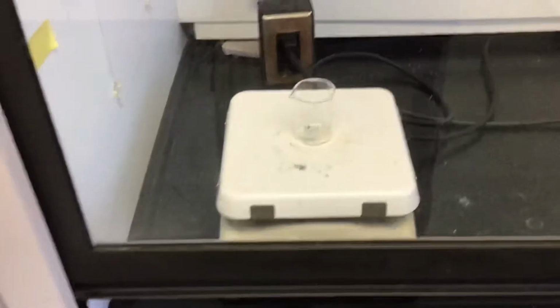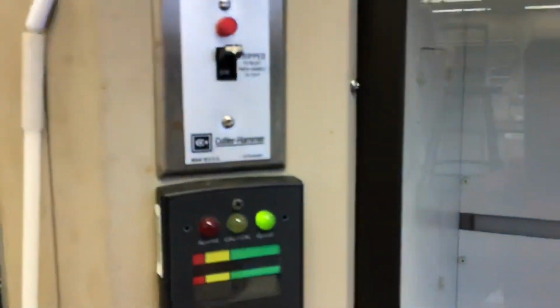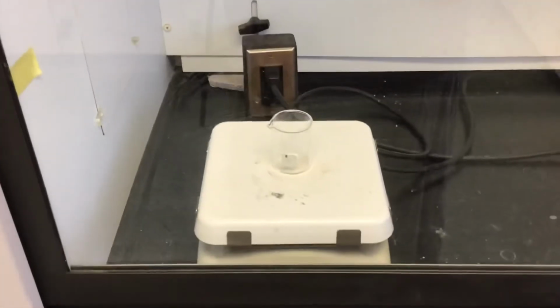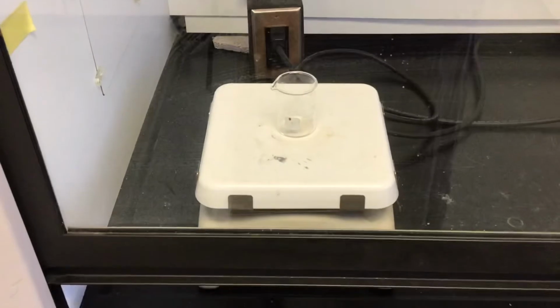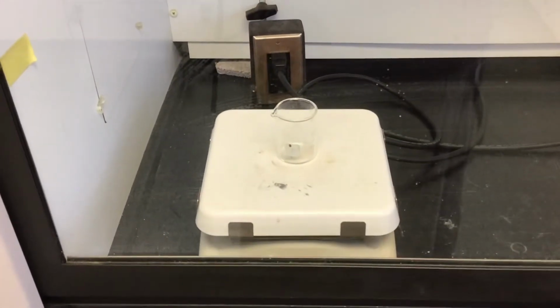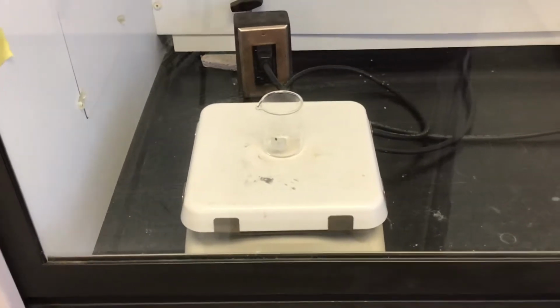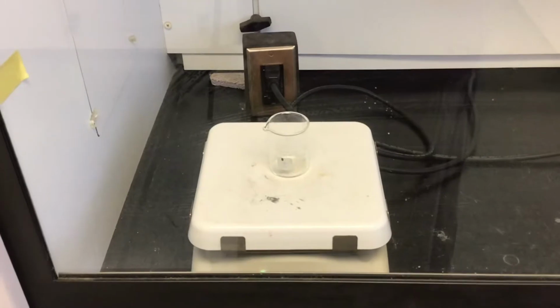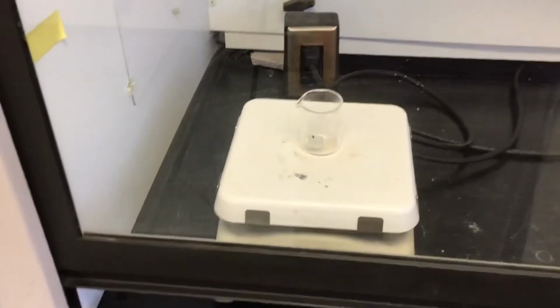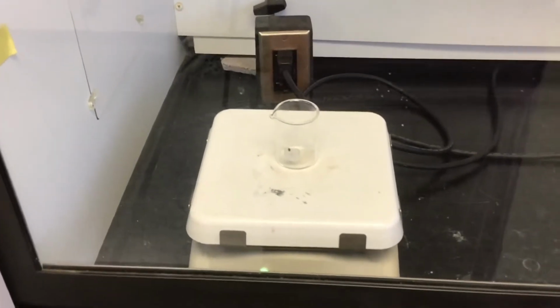Alright, so I turned it on. I have to make sure I actually turn on the hood as well. I think you can hear it now. We will be subliming the ammonium chloride when we do this. I just turned it on, so it's not hot yet. It's going to take about 15 minutes or so. I'm going to pop back in, and I'm going to let you see the white smoke that comes off, and that white smoke is the sublimation of the ammonium chloride.